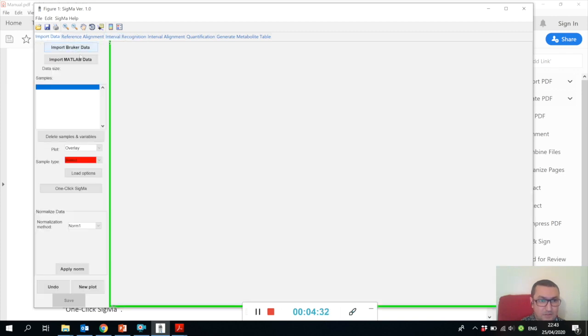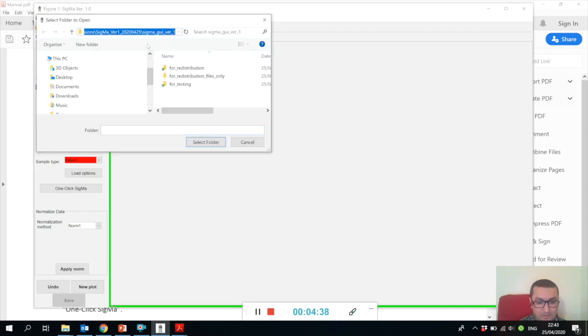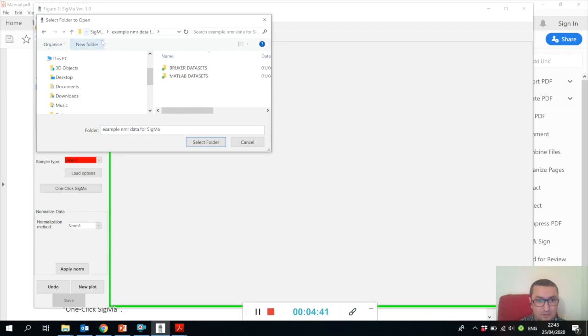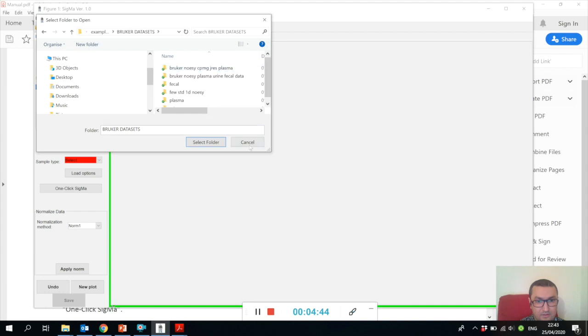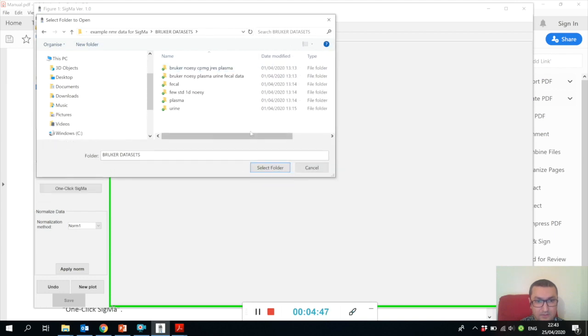Let me just show you by opening the Bruker raw data files. I already prepared some raw data files, so let's open some urine spectra.